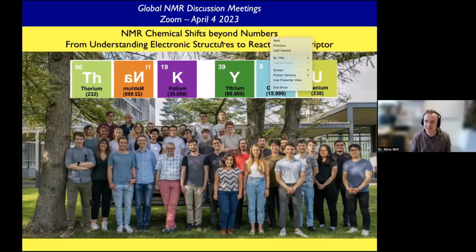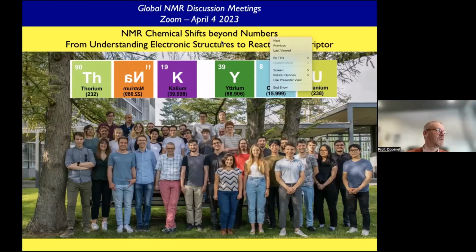Okay. Then there's another question by Amrit, and he had to type it in the chat. Can you comment on the application of these methods to fully inorganic solids? So we are working now on cadmium. For example, if you look at quantum dots or zeolites, it's fully transferable. I think any analysis you do on one nucleus can be applied to another nucleus, and it is independent of the system that you are using.